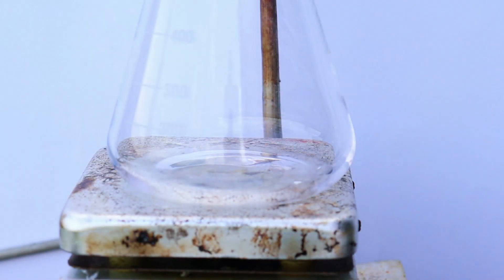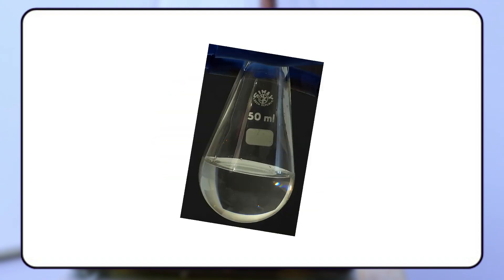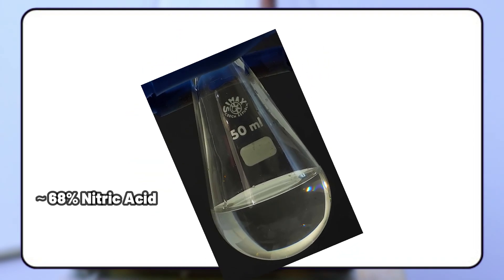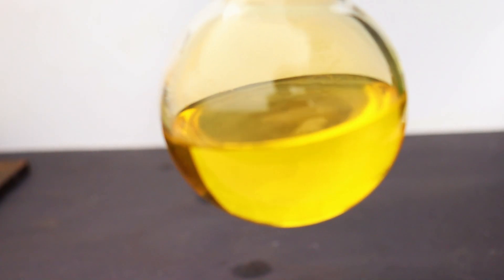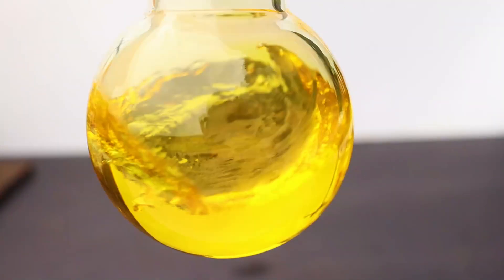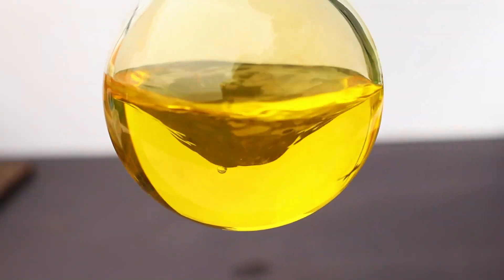Hi guys, and welcome back. You've probably seen some ordinary concentrated nitric acid before. It's a colorless liquid that gives off a little bit of fumes. But today we will find out what nearly 100% nitric acid is like, and we'll explore some of its unique properties.